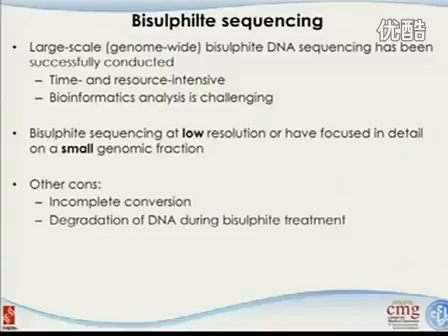And there are some companies that you can send the samples to, and you tell them, here are the regions I'm really, really interested in. Please just focus on these regions. And then they evaluate all the restriction enzymes, and they design the proper size of the gel where it cuts, and they do a pretty good job on that.